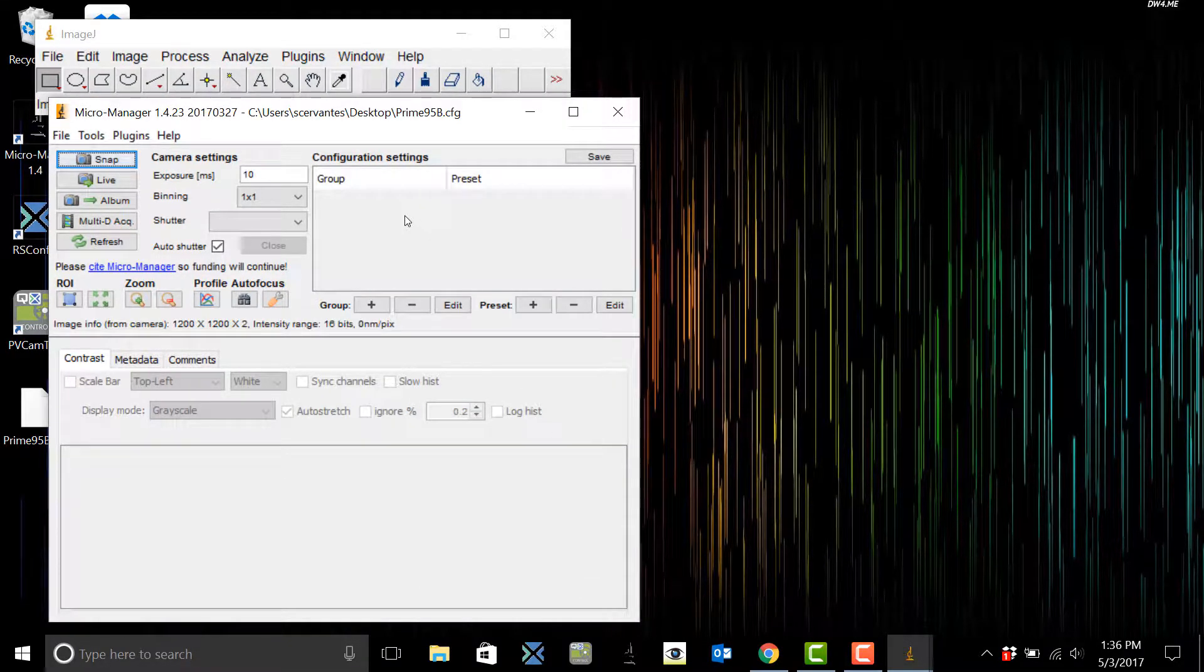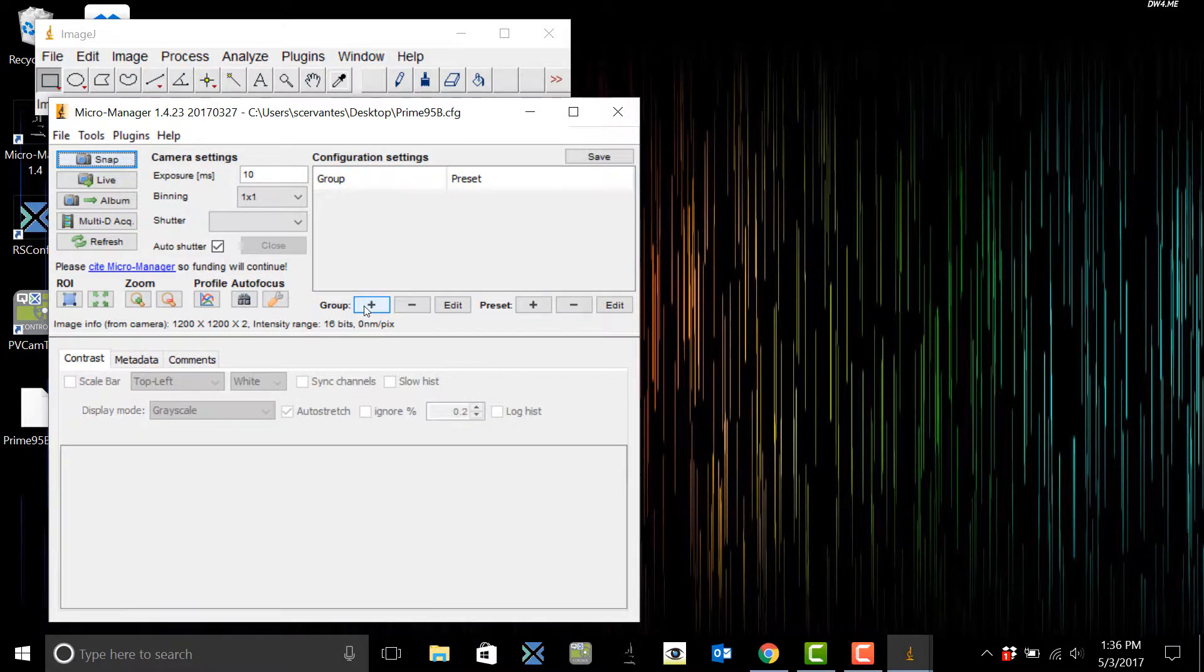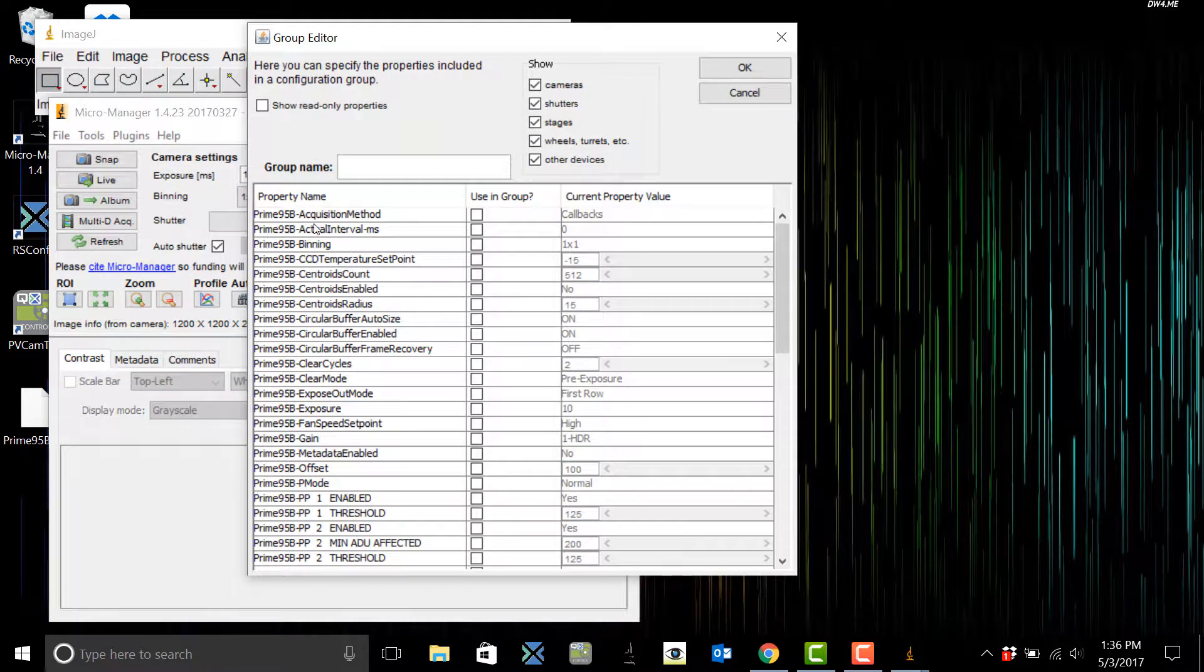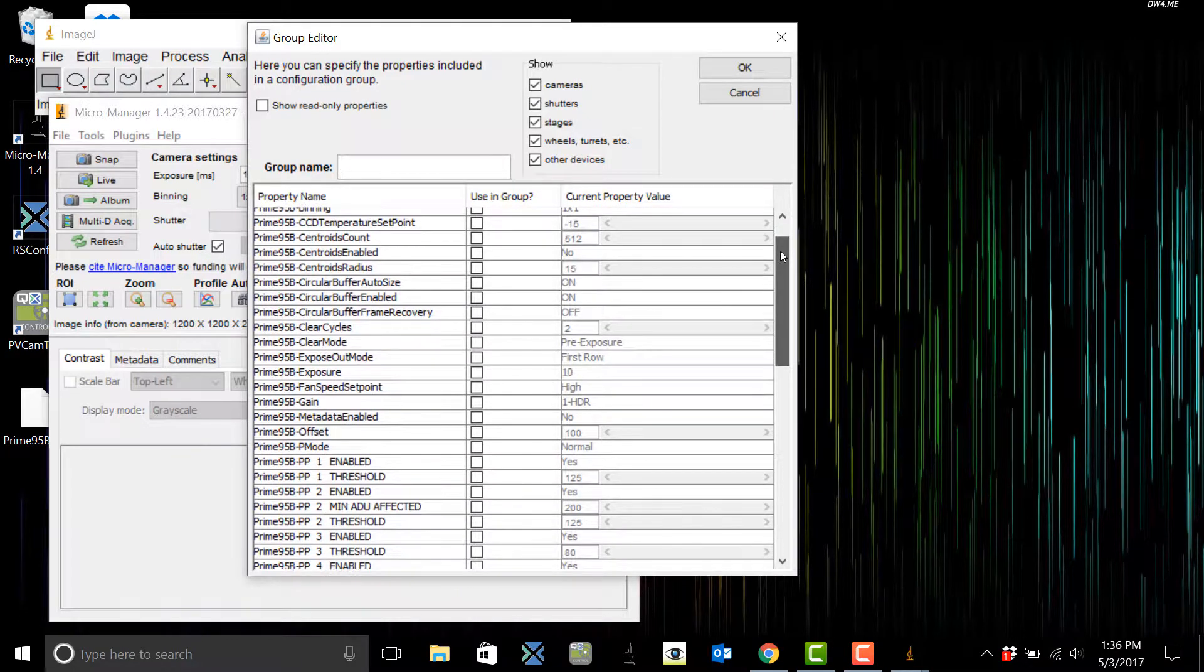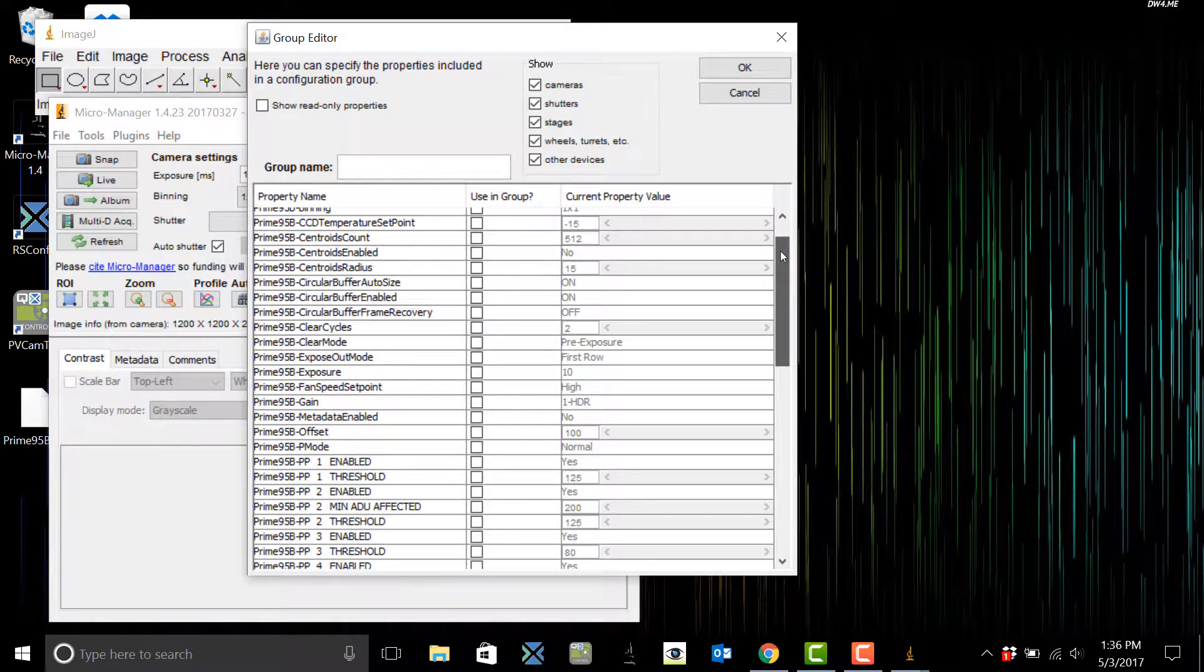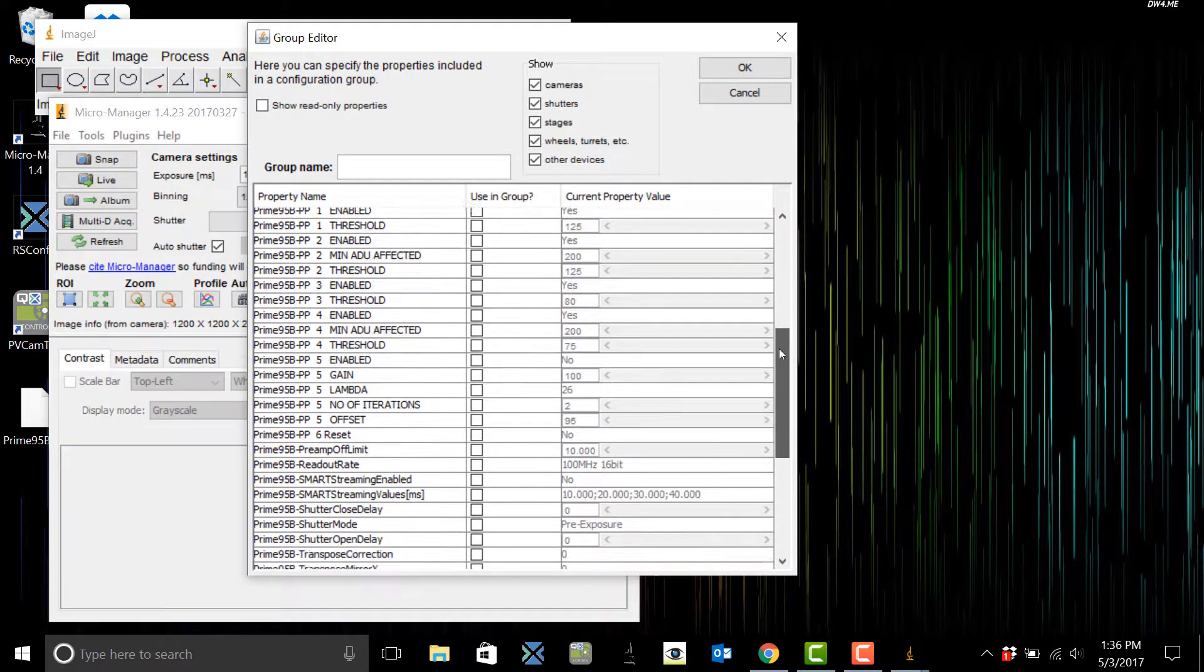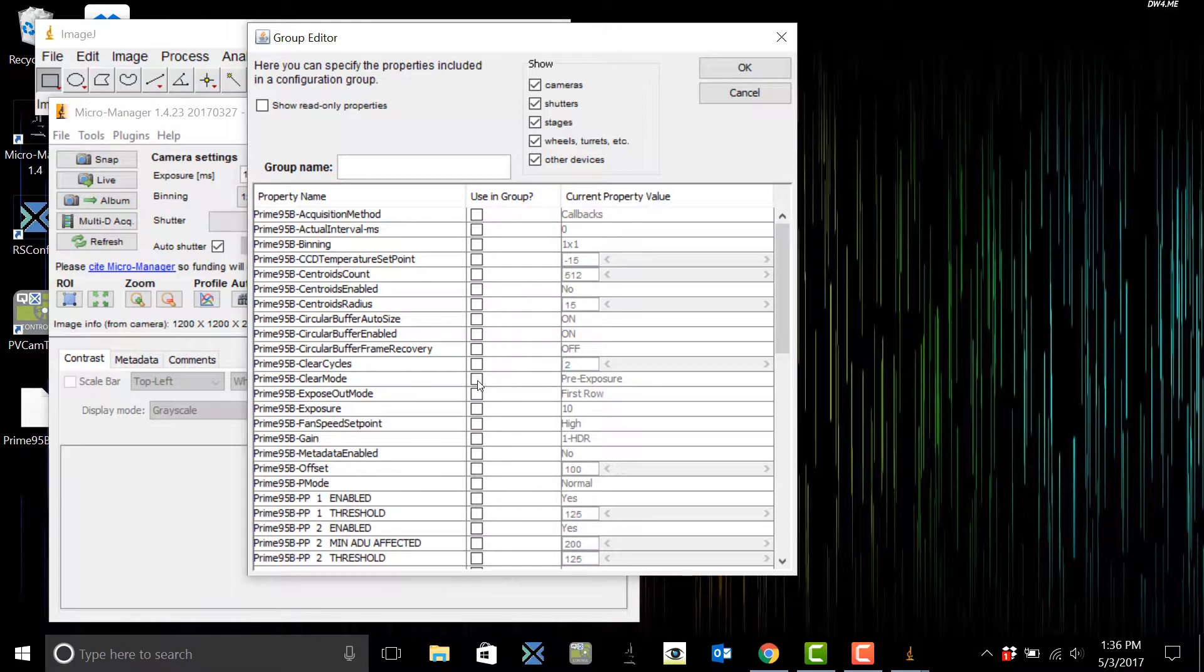This is going to open up the group editor. Here you can see all the different camera controls that you can select to make a group. So first you'll click the Using Group, will click Clear Mode, entering Clear Mode, and then hit OK.